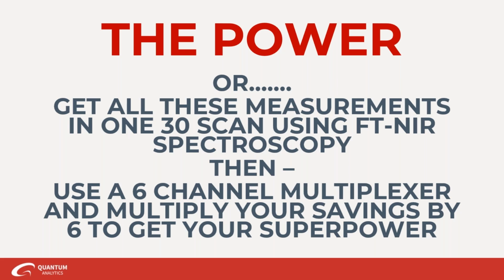That is an interesting question. It's something maybe I'll dig in and do a little more research into. But I would say that the resin manufacturing is definitely a documented, proven method. We saw it here during the show, and I don't think doing it the UV way would affect that too much. If anything, it would probably be even more beneficial to get your readings quickly. Yeah, and I think even with that non-contact emission probe would probably be a good way to monitor these curing processes, especially if it's a resin that's been sprayed on something, or a coating of some sort. So, all right.